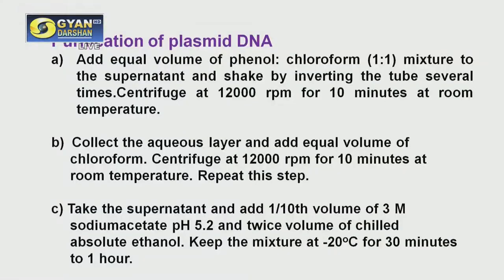Don't get super excited by seeing the different instruments and start handling them without knowing the operation procedure, because these are very, very costly. It costs in lakhs, some 5 lakhs, 4 lakhs, and if the instrument gets damaged, your total practical experiment will come to a standstill. So be careful. Okay, so centrifuge it at 12,000 rpm for 10 minutes at room temperature.